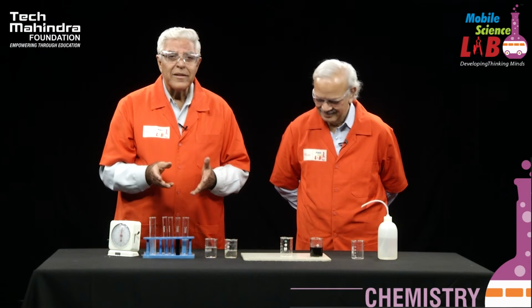So you see, students, this is such a lovely experiment. You can learn so much of chemistry with just a few simple chemicals.